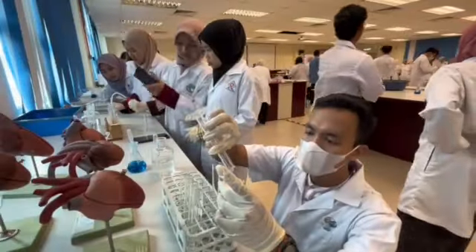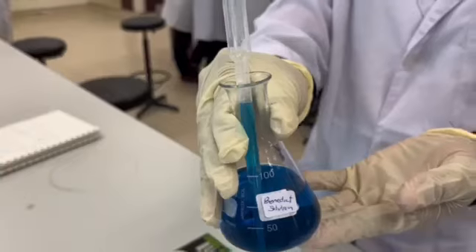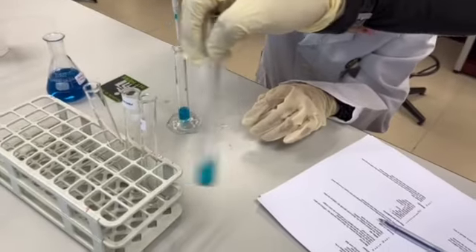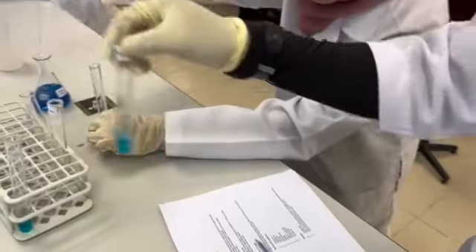Place 1 ml each of sucrose 2%, glucose 2%, maltose 2%, and starch 5% into separate test tubes. Add 2 ml Benedict's solution into each test tube. Mix by gently shaking.